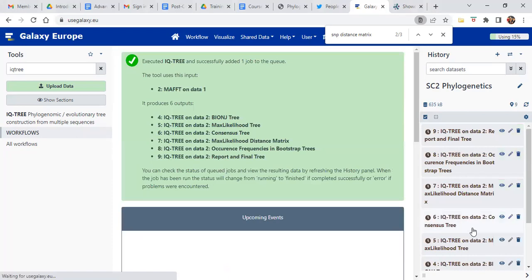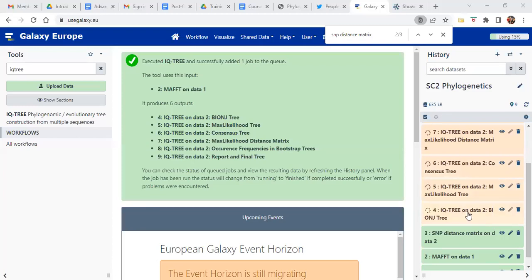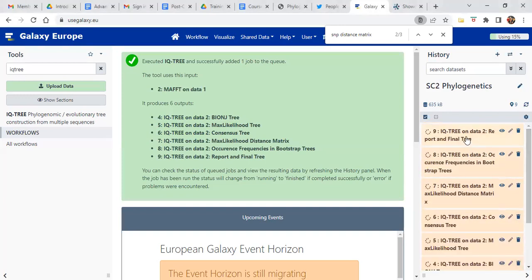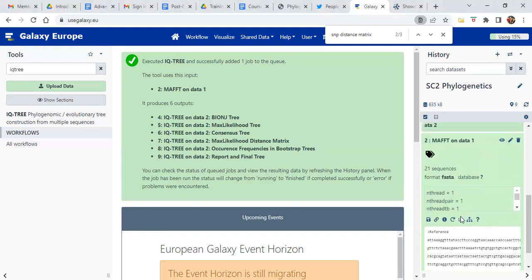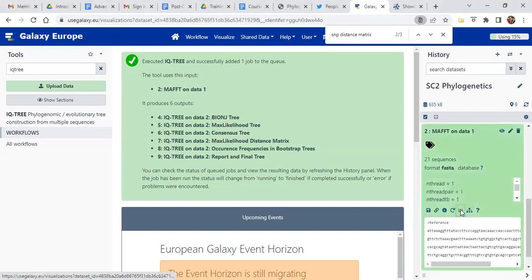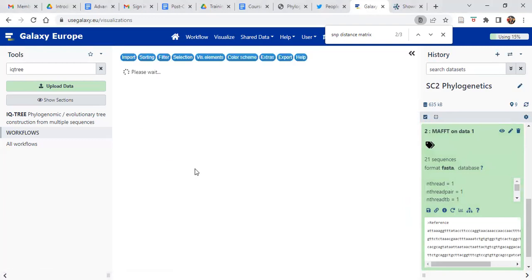This is going to create multiple output files. The first file and the last file are the ones we will use. The first one is called bioNJ — NJ is for neighbor joining. Now let's have a look at the multiple sequence alignment. Click on the name and scroll down and you'll see something that looks almost like a graph. Click on that and then click on the multiple sequence alignment. We'll be able to see how these samples are aligned with respect to one another.